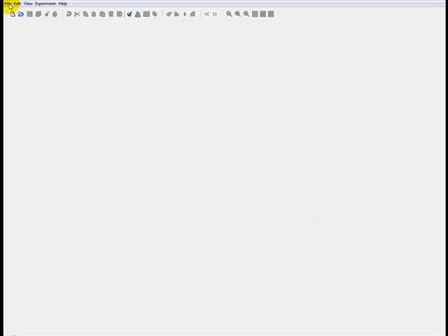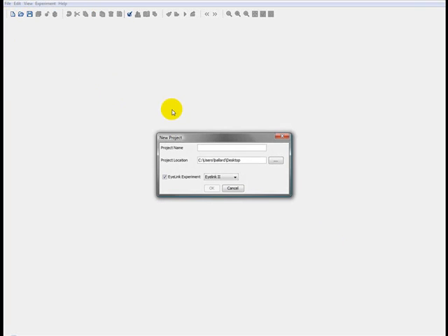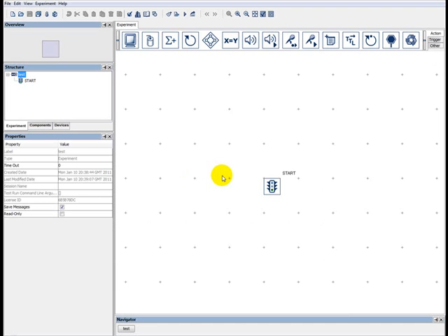So we'll go to File and New. We're going to call it Test, and then we're going to uncheck EyeLink experiment, because for now we are not going to be making eye tracking stuff. You can obviously, if you change your mind and you want to put eye tracking stuff into it, just click another checkbox later on, and then like magic it's all suddenly appeared in there. That's just a generic warning, not very exciting. So we get this first nice empty area to begin with.